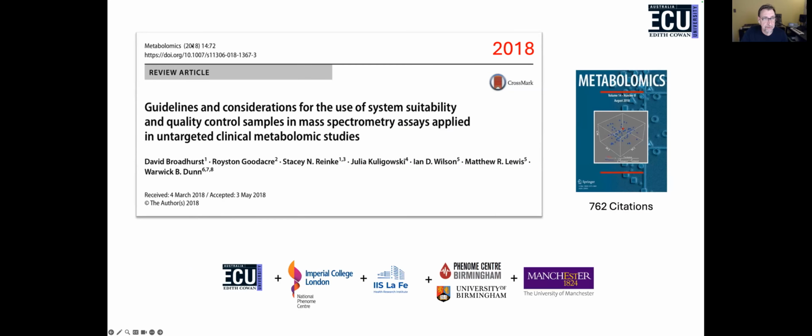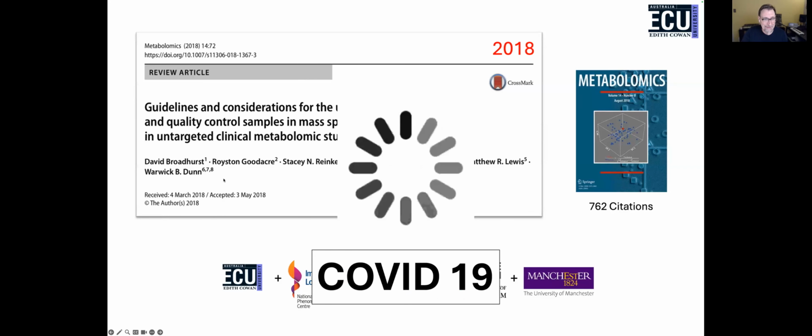So jump ahead to 2018 is when we then pulled together our expertise at that point and wrote this guidelines paper, which I mentioned at the start of the talk. And like I say, this software that I've developed is a companion to this paper. But again, there was a big delay between 2018 and 2024 when it came out, and a lot of this was down to COVID. But equally, COVID was the catalyst: a lot of our lab closing down and a lot of our projects getting put on hold gave me the time to actually start developing this software.